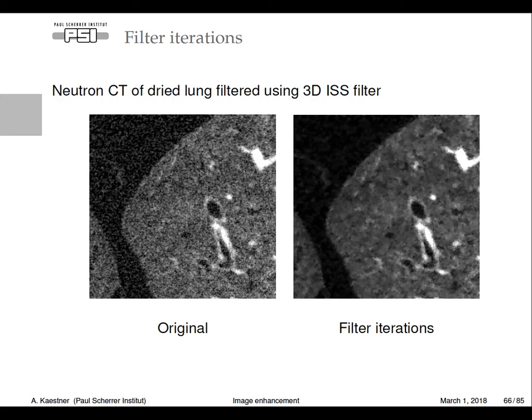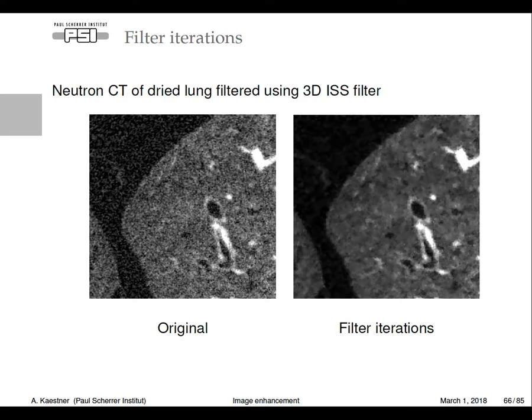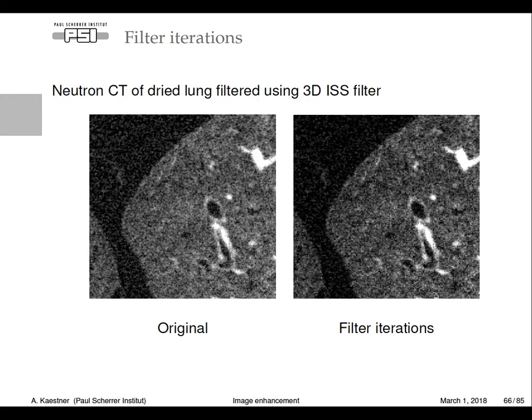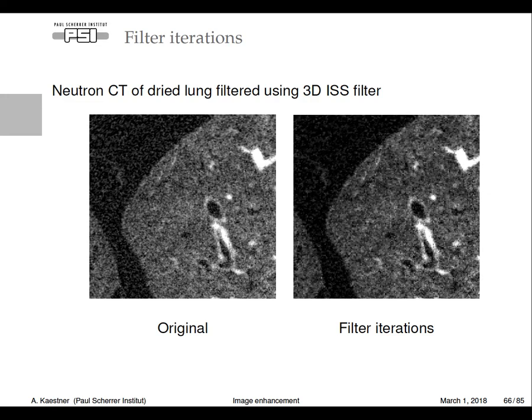But this one has helped us, for example, getting from a single histogram mode, where all gray levels are just one big undistinguishable blob, and afterwards we were able to segment 7 different classes applying this kind of filter. So it's very powerful, and if you want to play with it, I can give you some hints afterwards on where to get some code to play with.